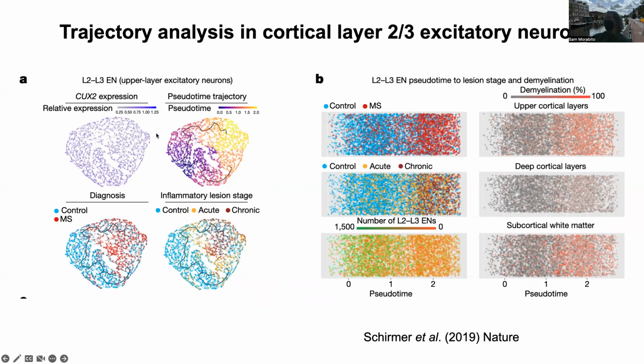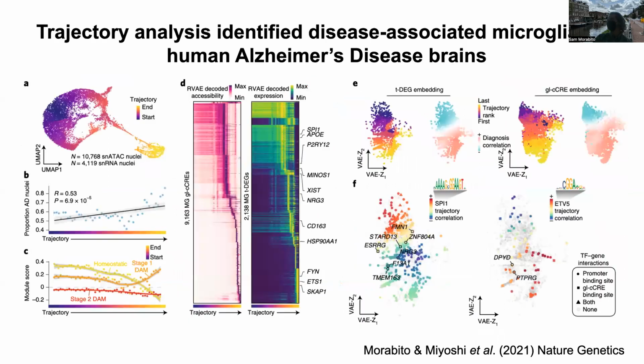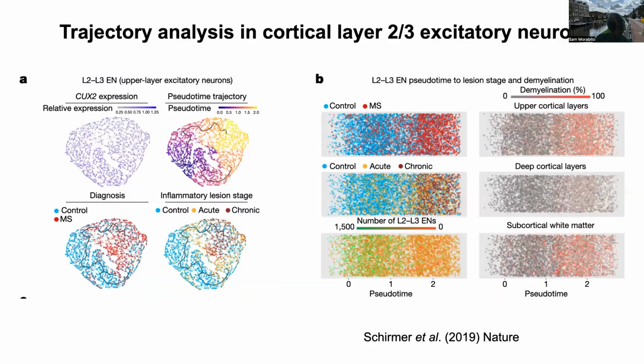So they're coming from the upper cortical layers, basically. And then they took that cell type and ran a pseudotime analysis on it. You see this is just a blob, basically. t-SNE or UMAP, it doesn't say. I mean, it probably does in the text, but it didn't say in the figure. And then they use Monocle 3, which is the same approach that I use here.